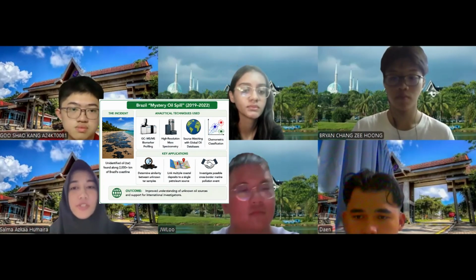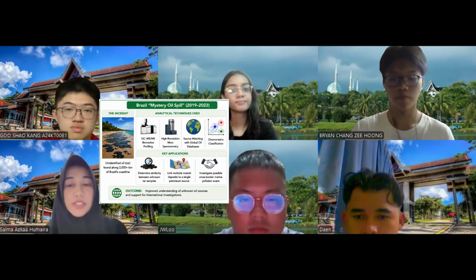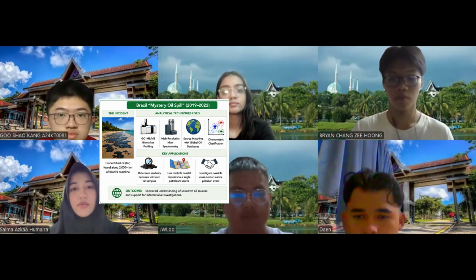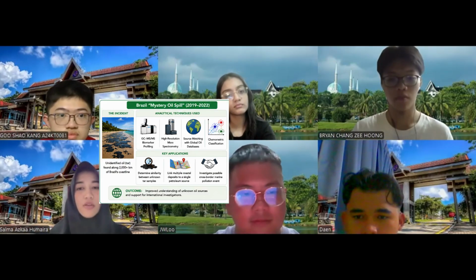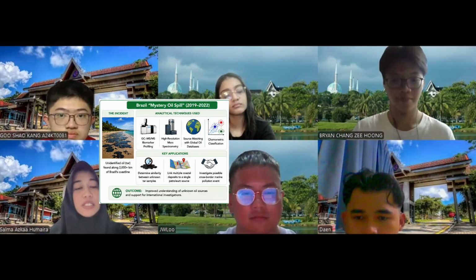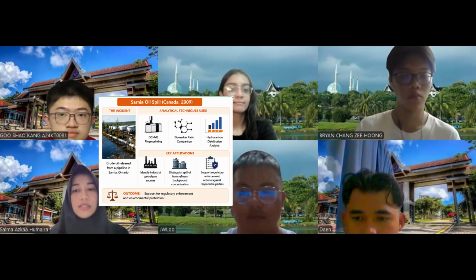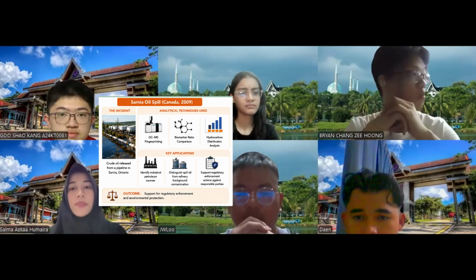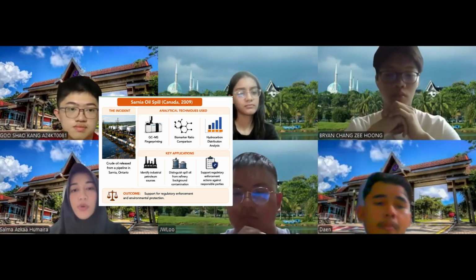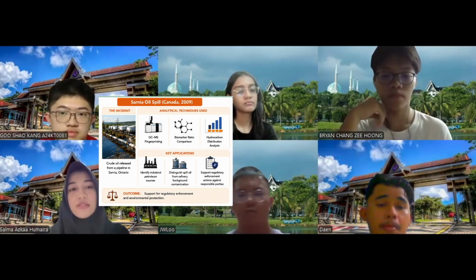Thank you. I think based on what Loo stated before, right? In the Brazil mystery oil spill case, scientists used GC-MS, also high resolution mass spectrometry, and statistical analysis to compare the unknown oil sample with the global database. This method helped to identify the oil source and also connect the different coastal spills to the same petroleum source. Meanwhile, for the Sarnia spill in Canada, they used GC-MS fingerprinting and hydrocarbon analysis to identify the industrial oil source, separate spill oil from the refinery contamination, and support legal enforcement actions.